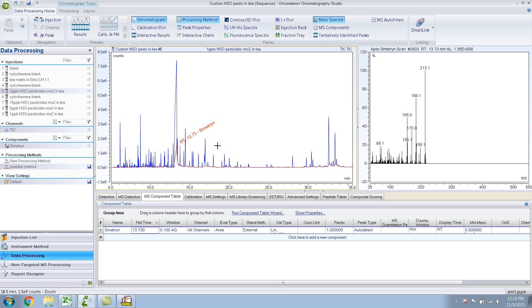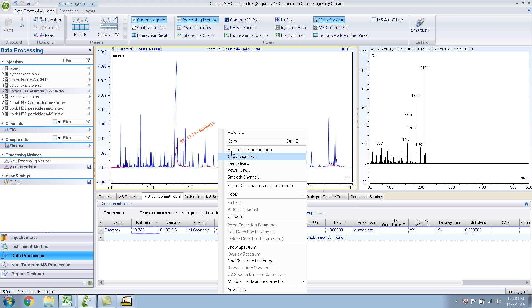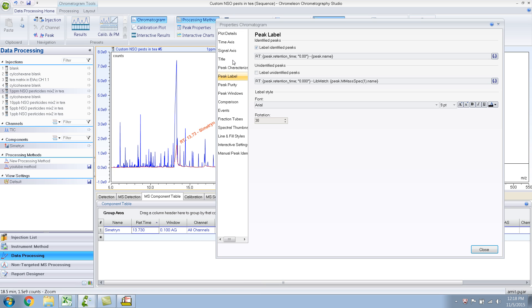In Chromelion in general, if you're trying to do something, it's a good idea to just right-click and look for whatever options are available. You can do many things in the properties tab. For example, in the peak label tab, if you want to label unidentified peaks — peaks which are not in the component table — you click that option and it will identify them by retention time and the first hit of the library match. This is very flexible.